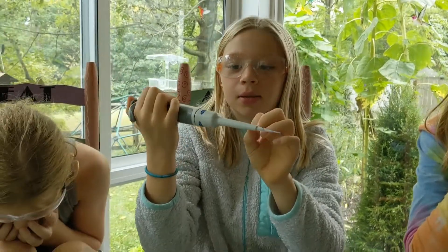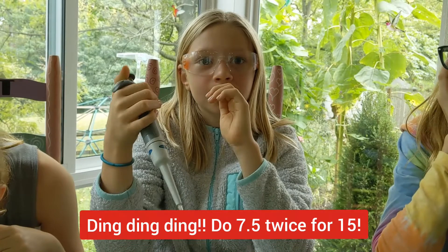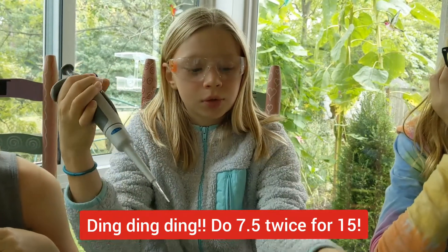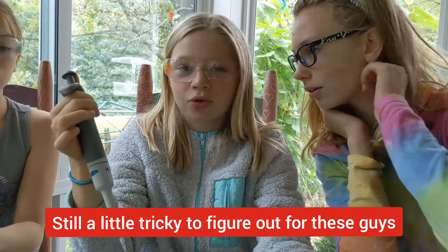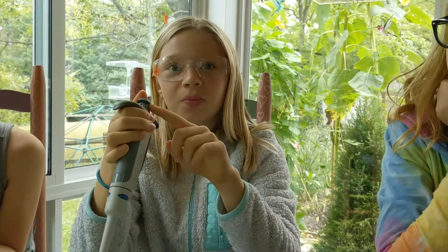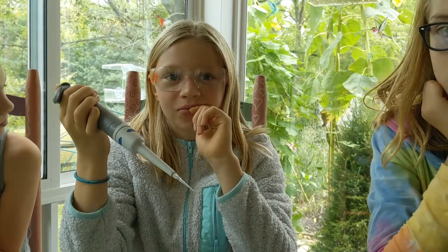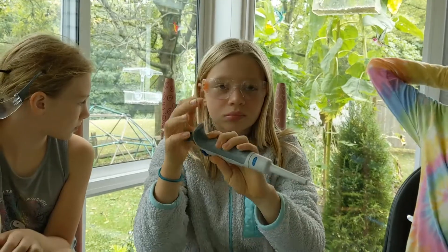What's half of 15? 7.5. For 15 microliter drops, just drop it twice at 7.5. That's what you do when you have a value between 10 and 20.